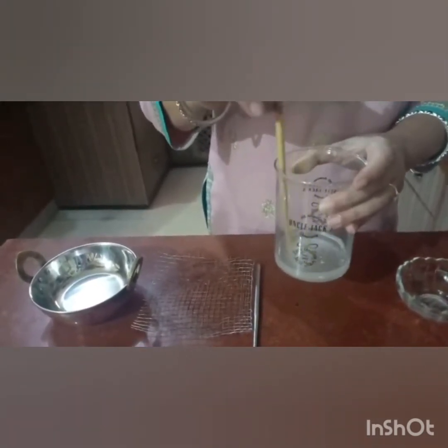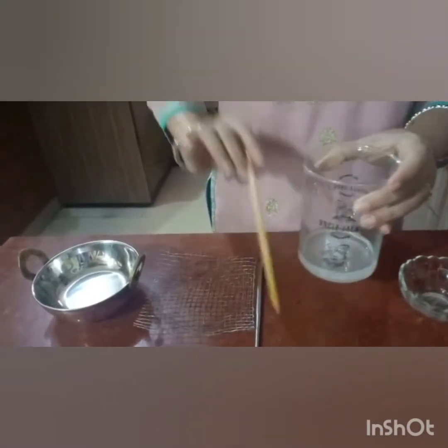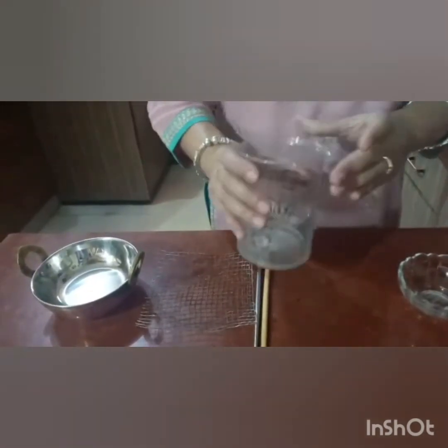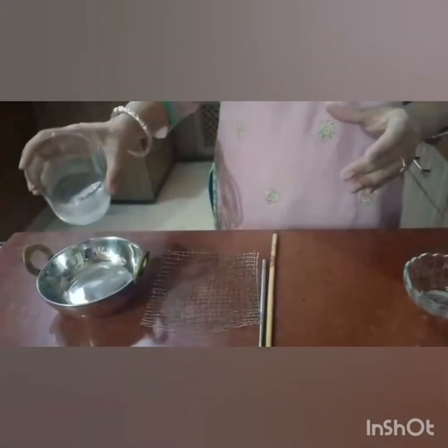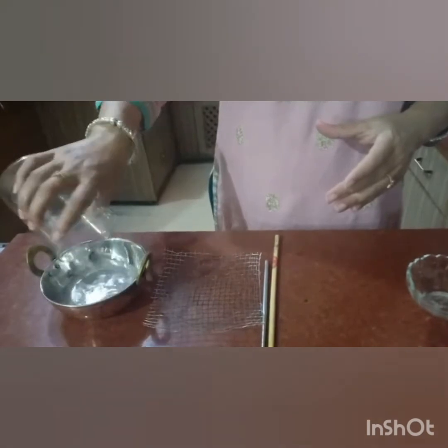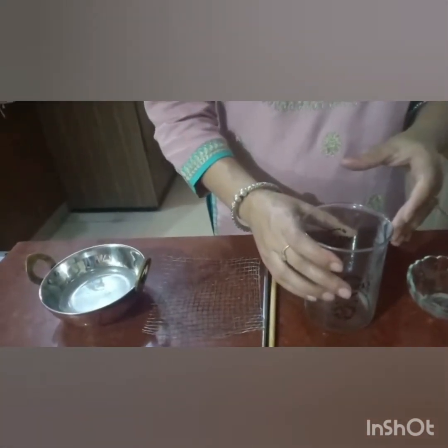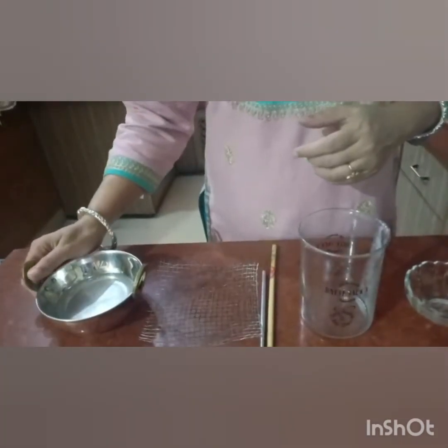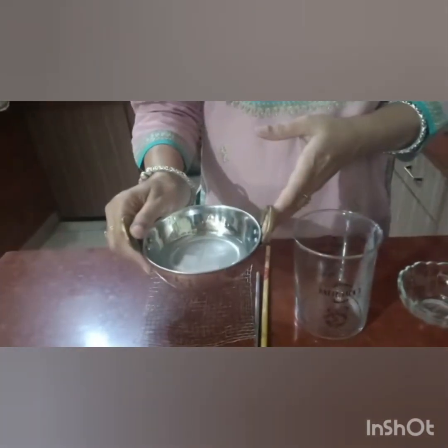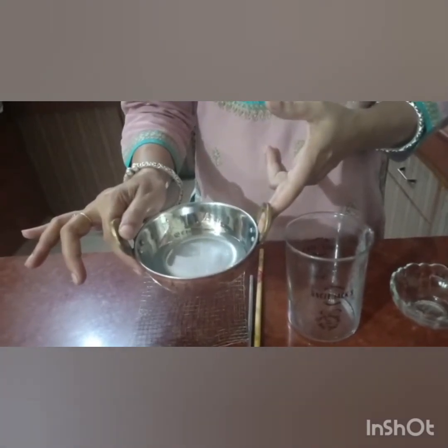So when your solution is absolutely ready, then you transfer this into the evaporating dish. Here I have this as my evaporating dish. You know that this is not the chemistry lab, so I am not having the actual china dish or evaporating dish, so I am using this kind of dish to evaporate.